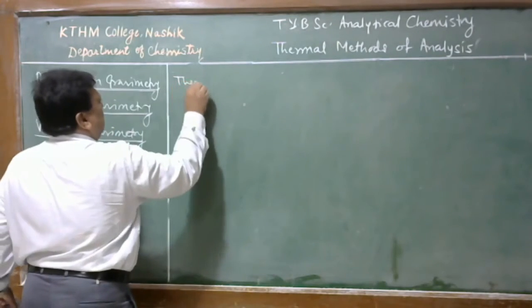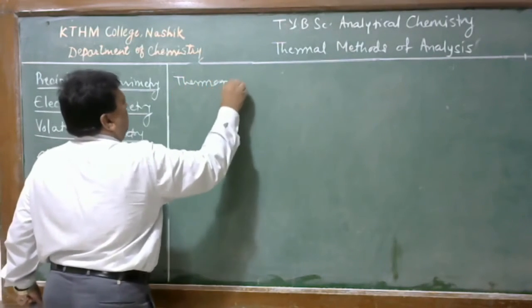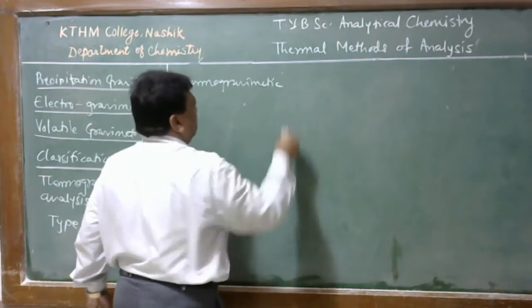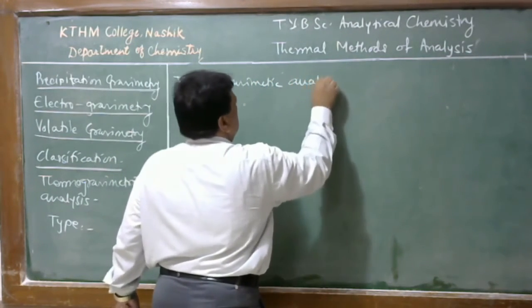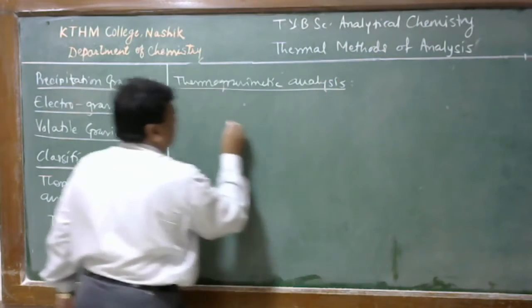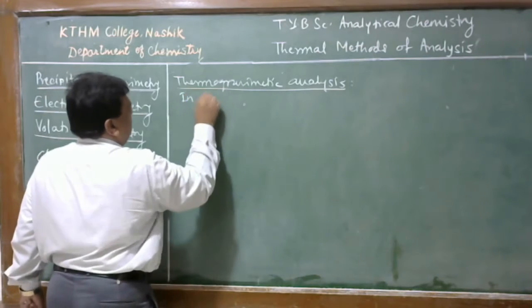First of all, we discuss thermogravimetric analysis, its definition.